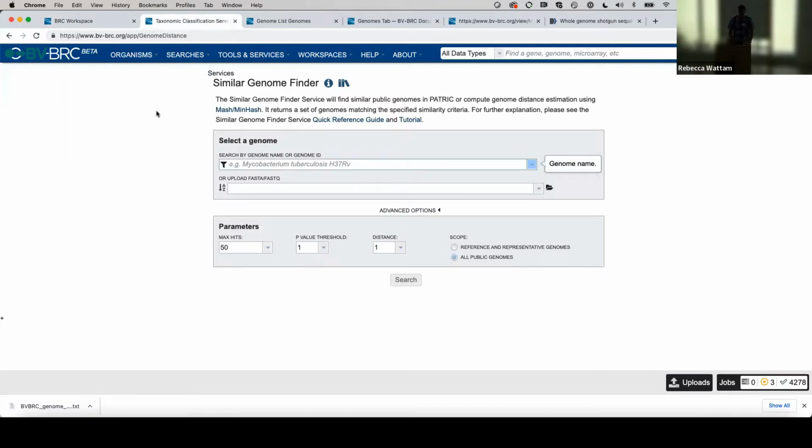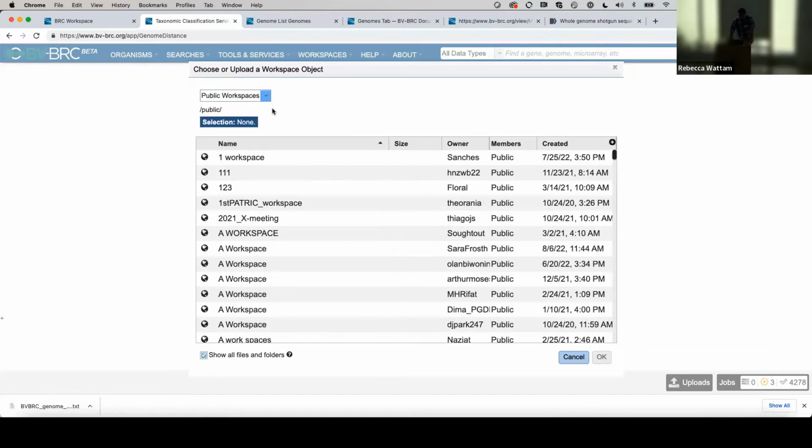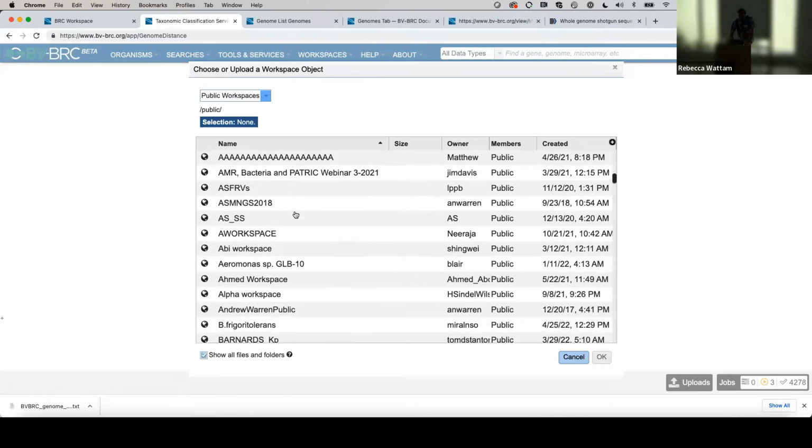The script suggests that we do the following. We're in possession of sequence data for some organism that we've just sequenced. The hypothetical case is that we are not exactly sure what organism it is that we just sequenced, and we want to ask, what is our genome most similar to? So we can ask the question, what is this bacterium that I just managed to sequence out of tsetse fly or whatever environmental source we collected it from? So the model is we have data. The data are in a folder, and the folder is in that workspace for the workshop that we're currently in.